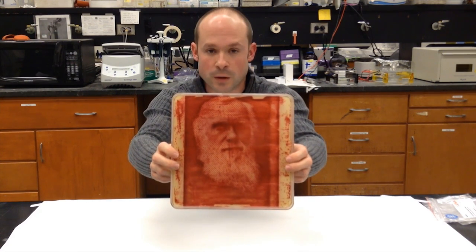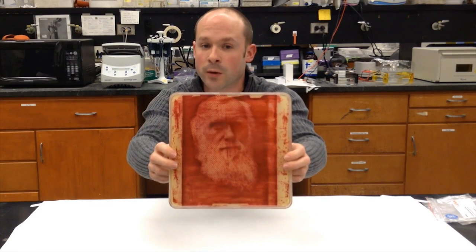This plate was made seven months ago, and as you can see, it still looks just as good as it did the day I pulled it out of the incubator. And that, in a nutshell, is bacteriography. Now you know how I start with bacteria and turn it into artwork.